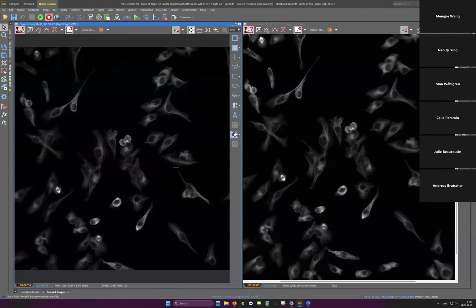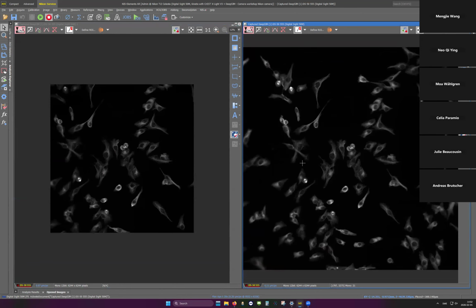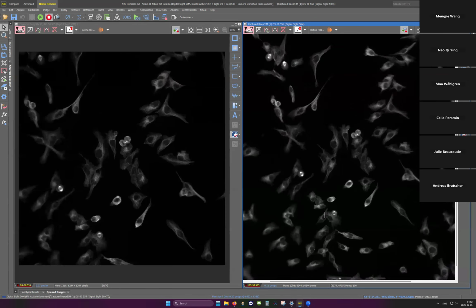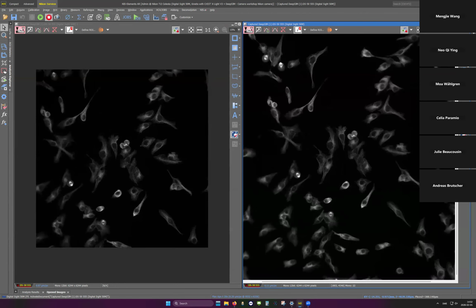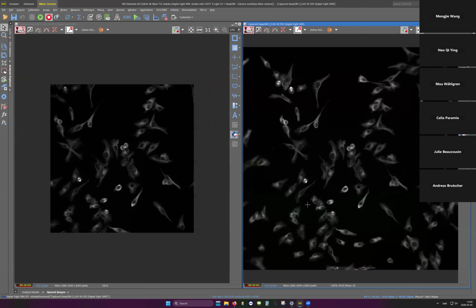So on the camera-based system, we're a lot less flexible than on a single point confocal, but we have some little tricks like binning and adding the extra magnification lens where we can change the pixel size of the image. And you can see at the bottom, if you can show Marie, where the pixel size is in the image. Here it's in blue, 0.07 micrometer per pixel in the one where we have used the extra magnification lens, and 0.11 for the one where we are without, so increasing the pixel size basically.